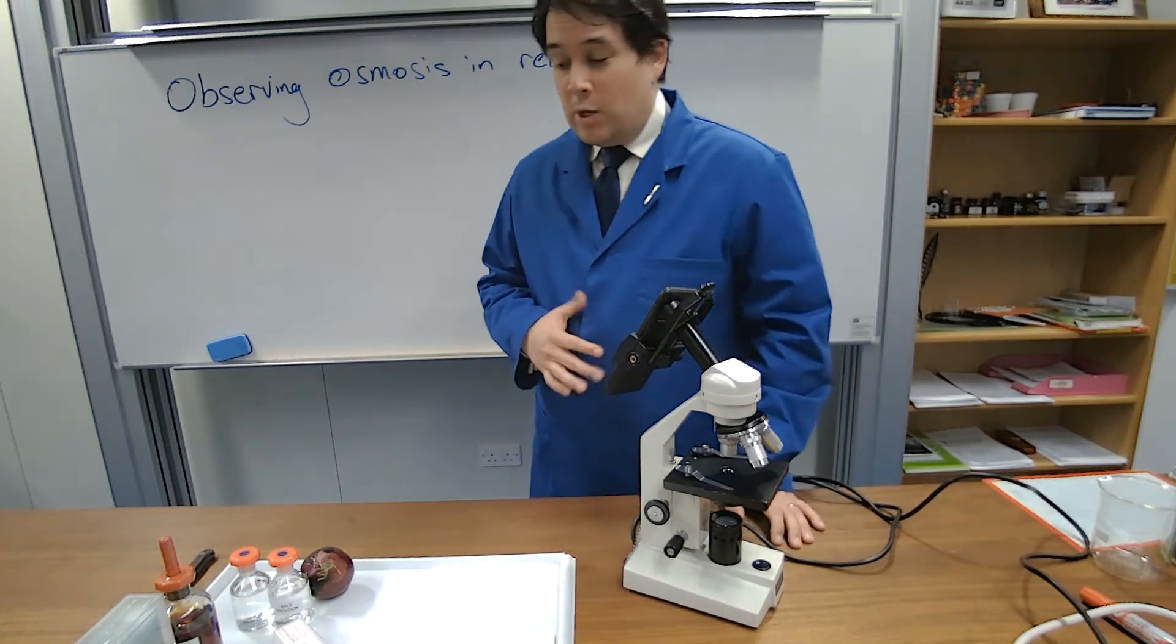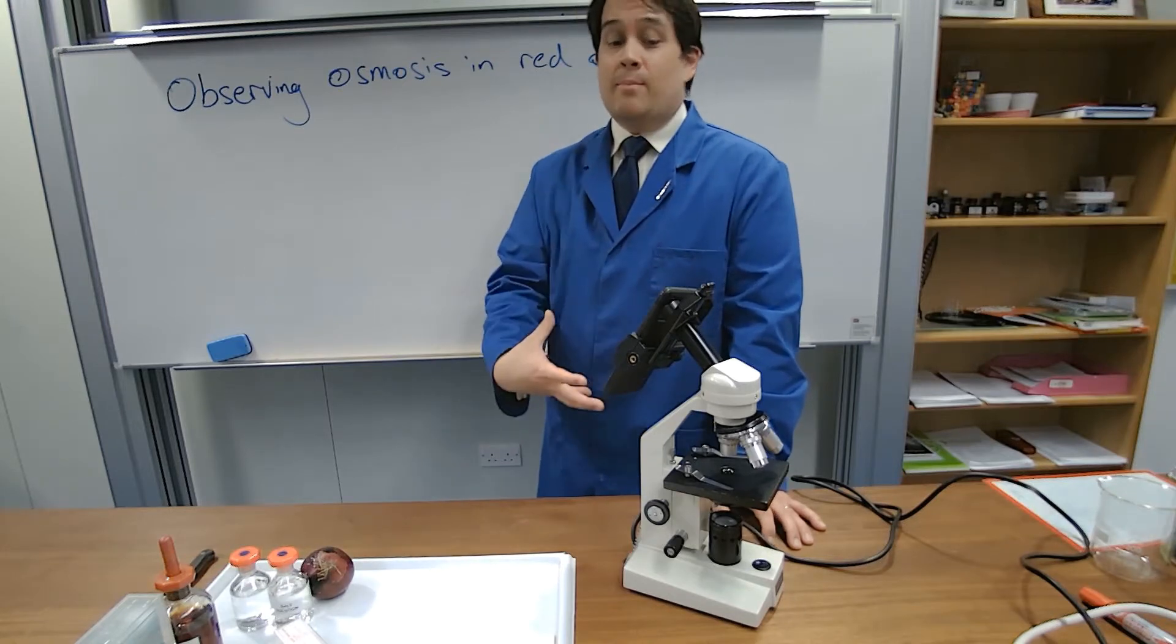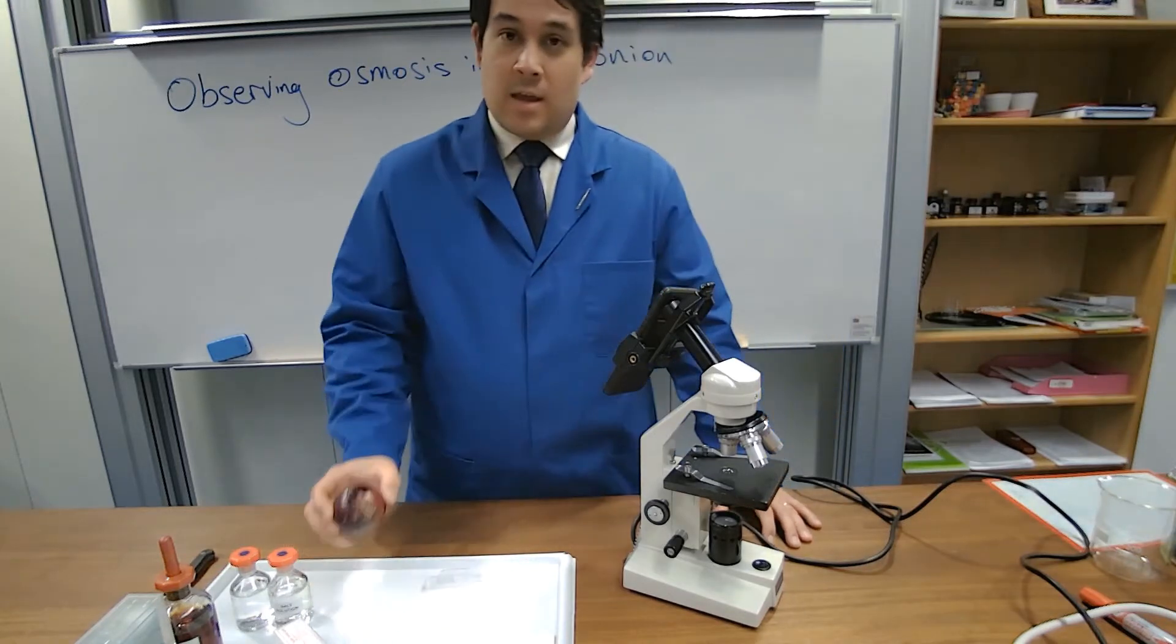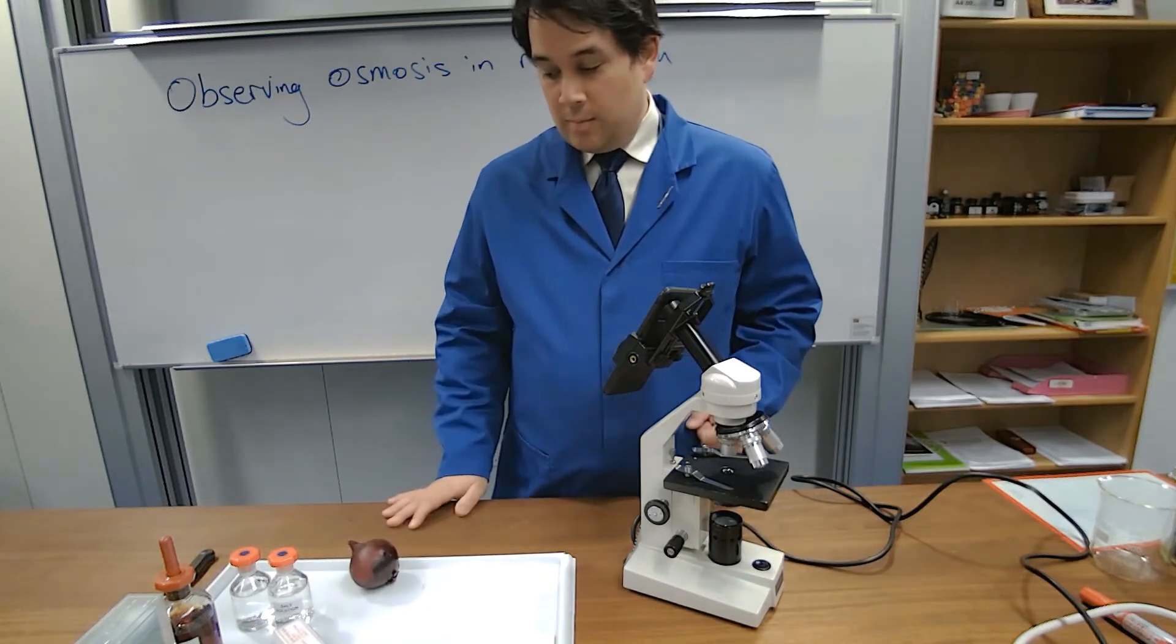Hello, today we're going to be observing osmosis in real time using red onion and a light microscope. So let's get cracking.